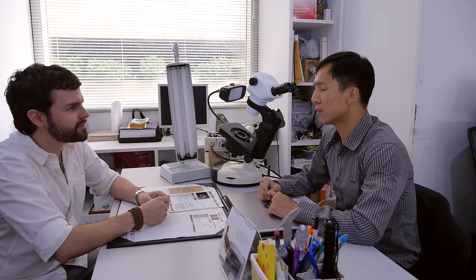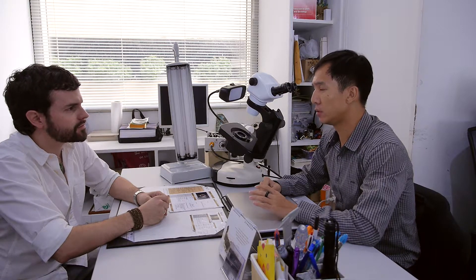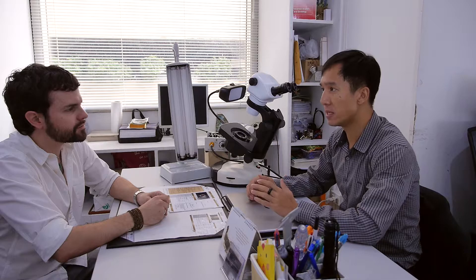So tell me what exactly goes into making a basic gem report? Okay, so basically we just check the stone to identify what it is by this instrument. So we're going to use basic or standard gemological equipment.